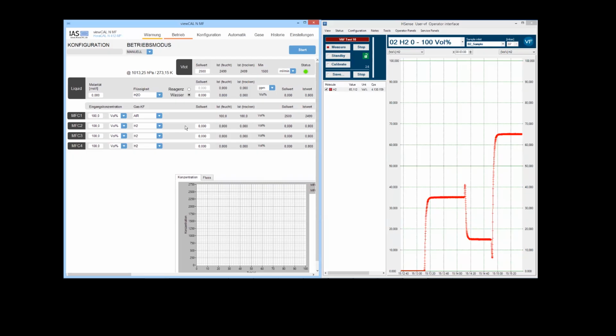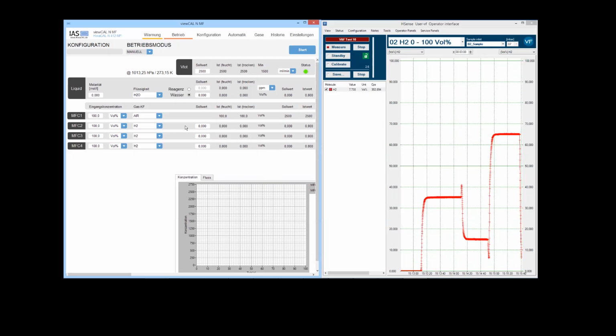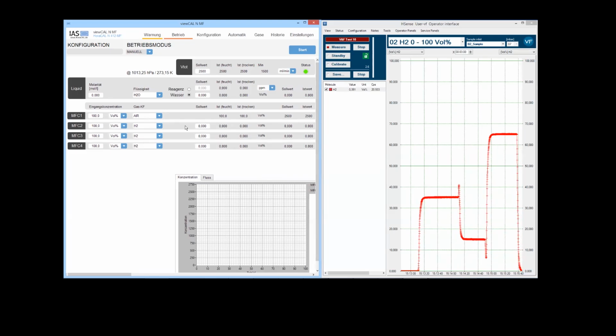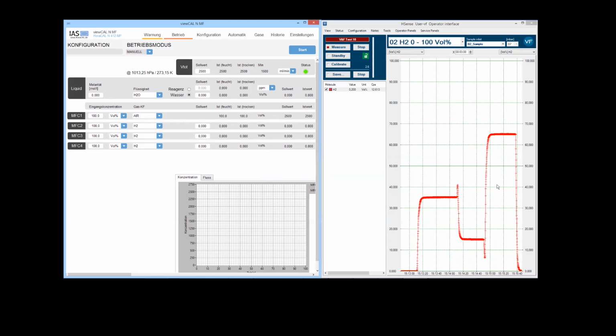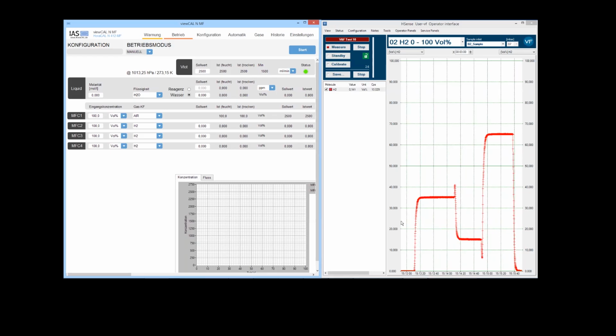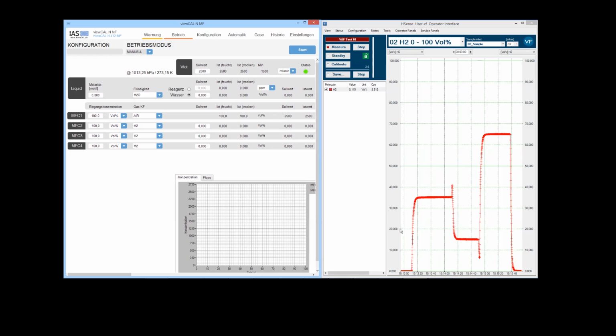The number of points that you want to check is pretty much within your own quality standard. What we do is we usually have around 8 points spread throughout the complete measurement scale of the instrument. And each of these is available to you on the analyzer record of your instrument.